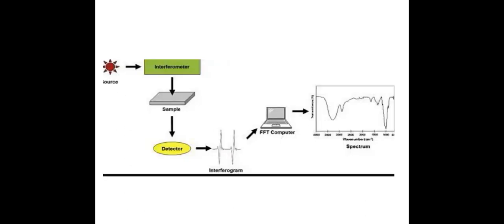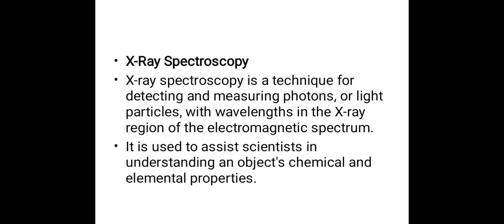Its components: interferometer, sample, detector, interferogram, FFT computer, and spectrum.